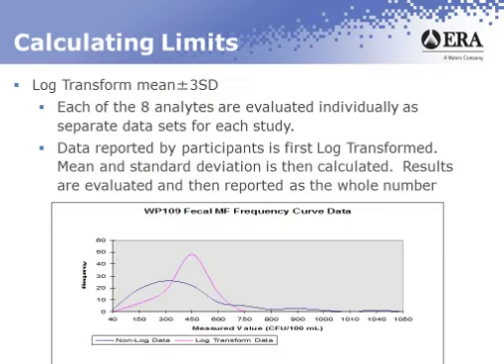The other area that's covered on that table is the acceptance criteria. It's listed as the log transformed plus or minus 3 standard deviations. That's the acceptance criteria that all the PT providers have to follow when it comes to non-potable microsamples for all of those 8 analytes. Let me try to explain that.